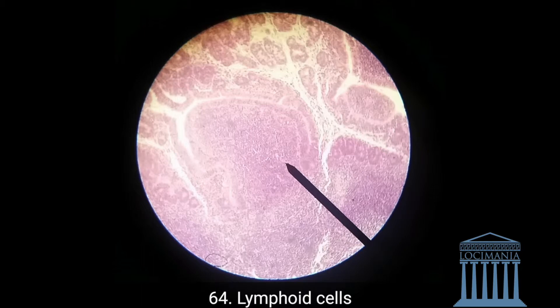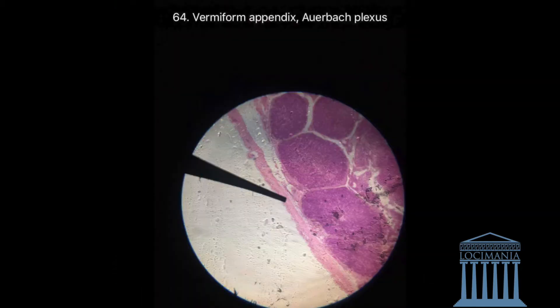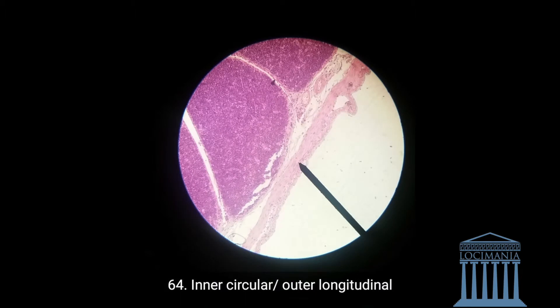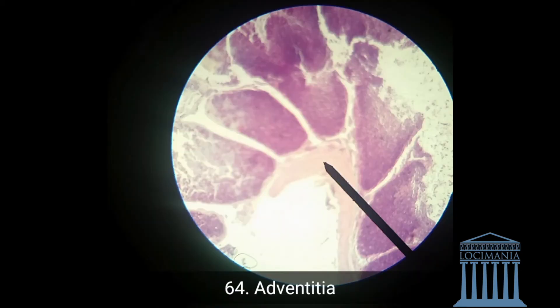Here I'd like to show you the Auerbach's plexus. Then here we have the muscularis — the inner circular muscle and then the outer longitudinal muscle. We also have the adventitia with blood vessels.